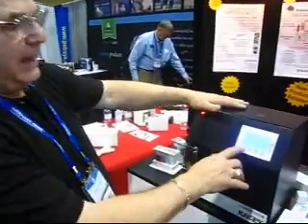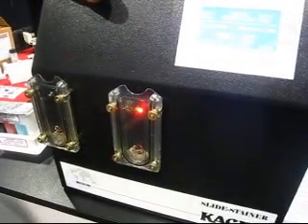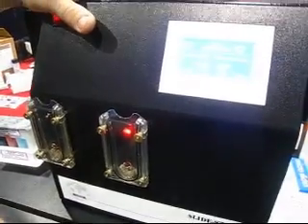This is an automated slide stainer. It's the last area of the laboratory that needs to be automated. You simply select the test that you would like to do, whether it be cytology or hematology, and press enter. Then you can select by placing an X, and the light will come on in the cuvette in which you're going to perform the staining.